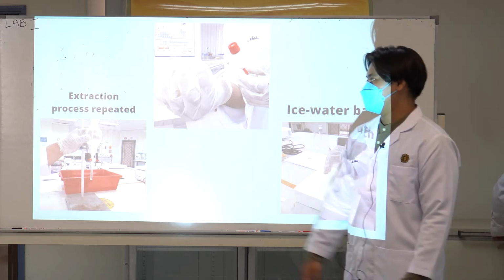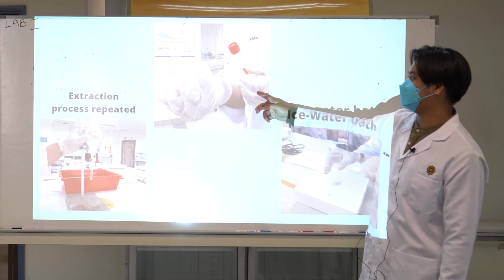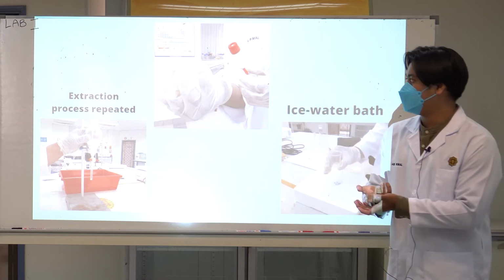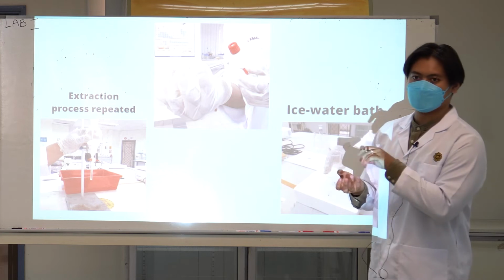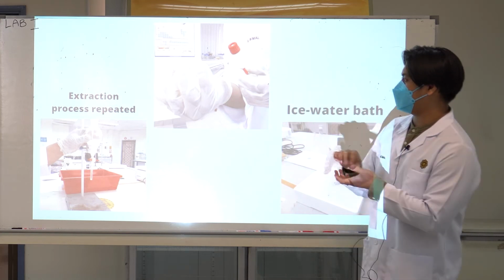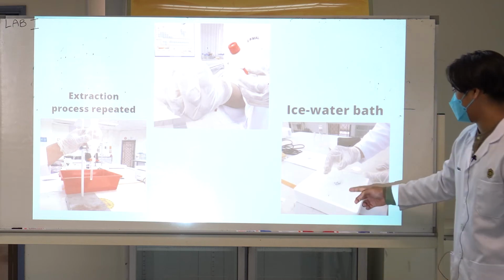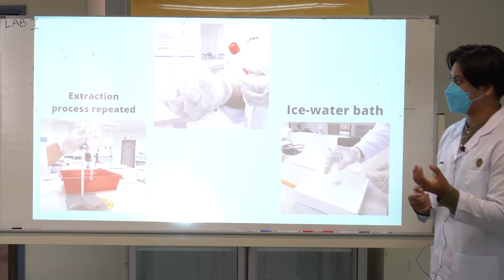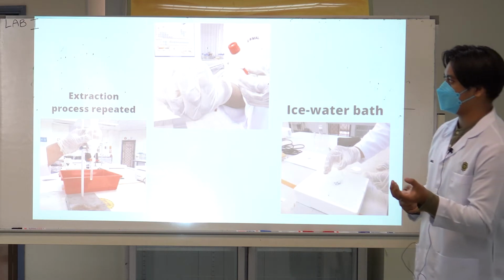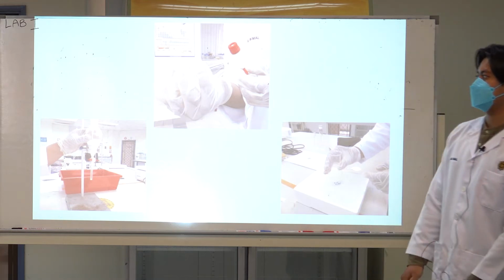Okay. This is the extraction process, and this is how to hold a separatory funnel when we shake the mixture. Then we need to open it to vent the gas. And this is the ice water bath, before we collect the precipitate using vacuum filtration. Alright, next.